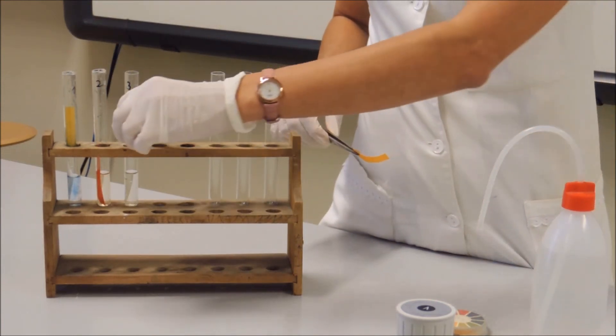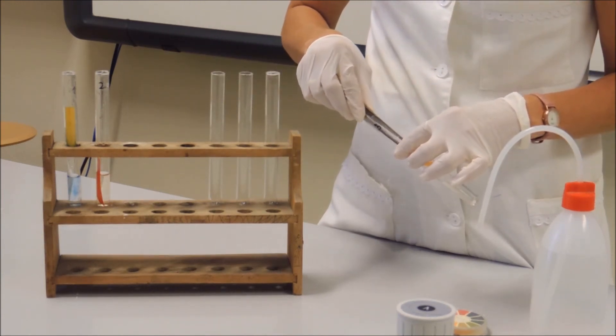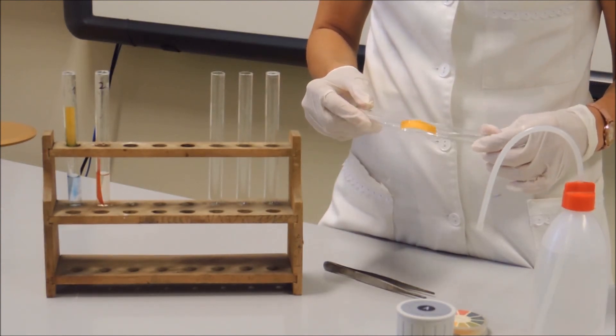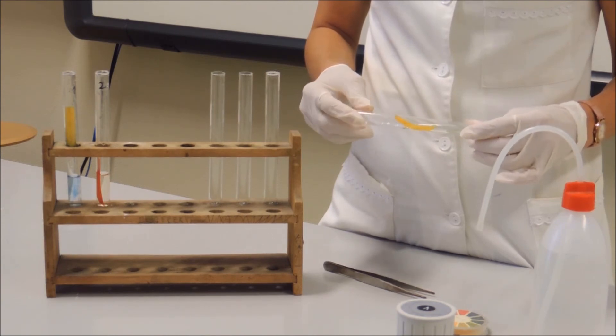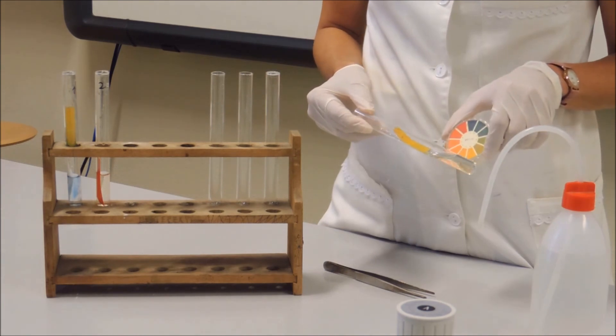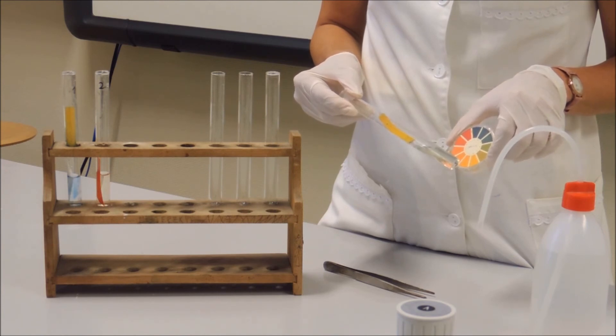Place pH paper in the last test tube. The pH paper's color is greenish, the solution's pH is neutral, therefore the third test tube contains glucose.